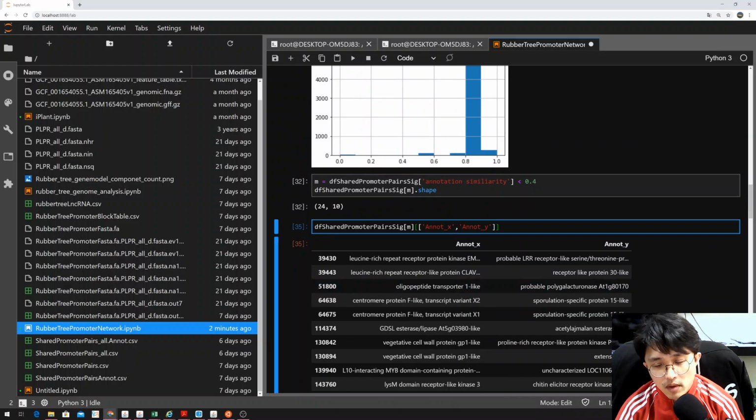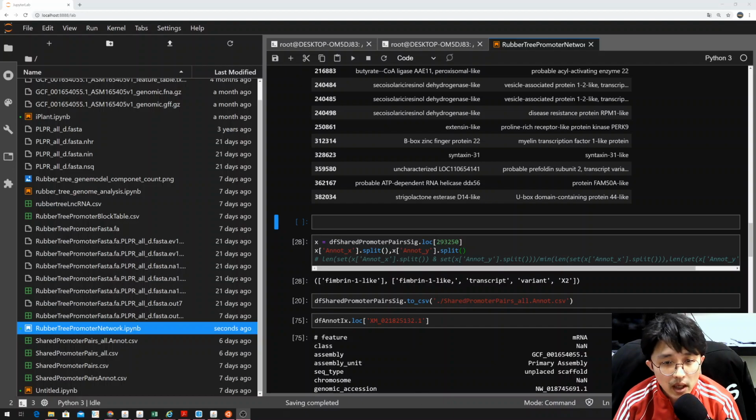I didn't have any plan to build a network, but now I can see a certain network here. So I will show you how to draw a network, because one person, maybe from another class, asked me how to use Cytoscape, but Cytoscape is not that convenient compared to the Python one. So I will come back soon with NetworkX. Okay, hold on. Okay, I came back.